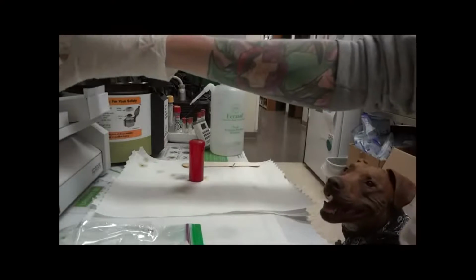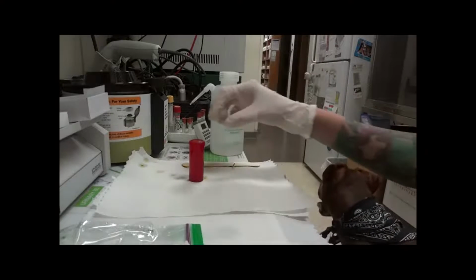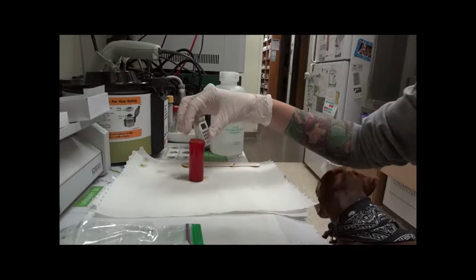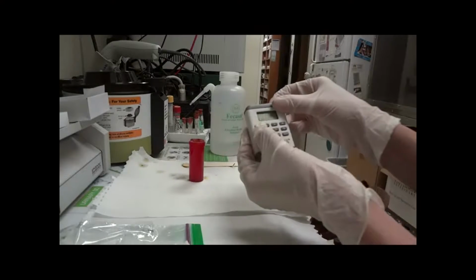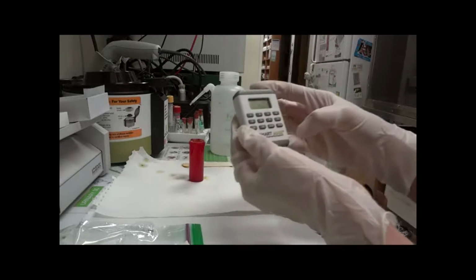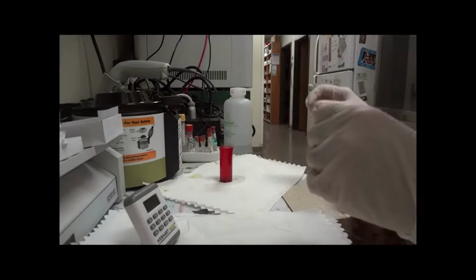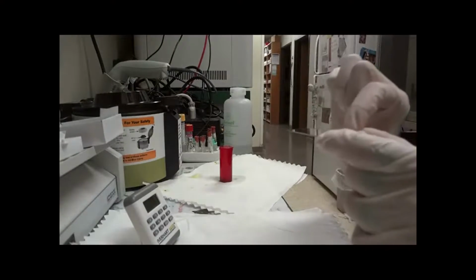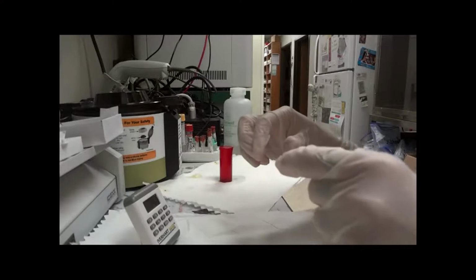Then we'll place a cover slip on that meniscus and set our timer for 15 minutes. Alright, our timer has gone off, so we'll take our cover slip and place it onto a glass slide so that we can view it on the microscope.